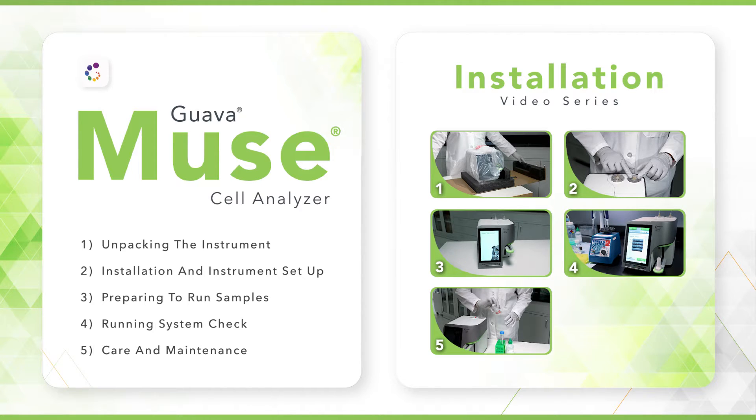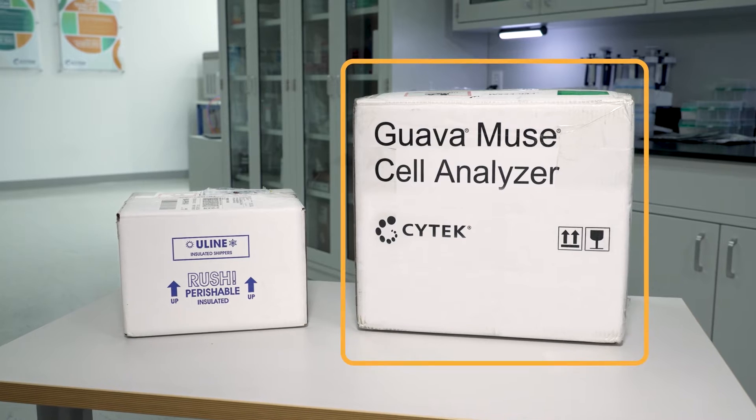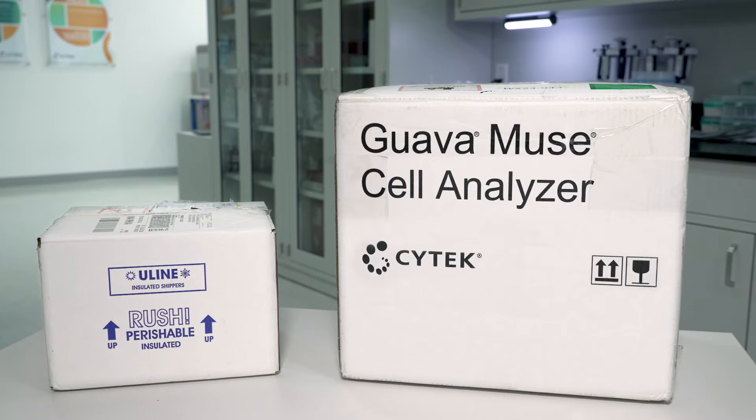This video is intended to support the Comprehensive User's Guide for the instrument. We recommend you review that document carefully as well. Your Guava Muse Cell Analyzer will arrive in a foam upholstered box for protection. We recommend you keep this box should you need to safely move the unit to a different location or for shipping purposes. You will also receive a second reagent box. Please locate both boxes before beginning installation.